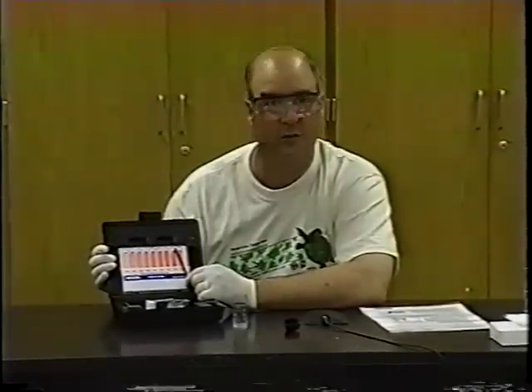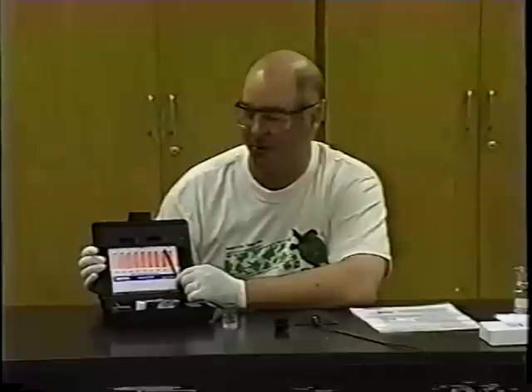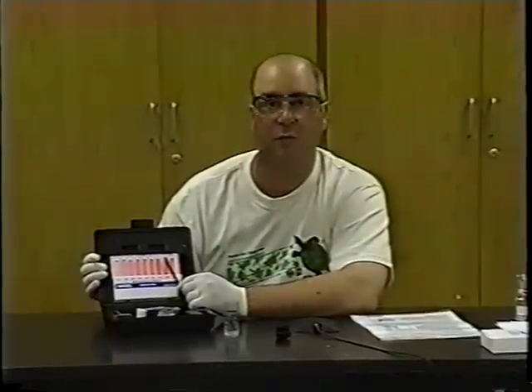That's all there is to do the test. Hopefully when we go down to the river, we won't see that much nitrate. I knew my fish tank probably had a lot because the filter mechanism wasn't working, so there was a lot of excess nitrogen in the water. There's our test for nitrate done once for you. Now you can practice it in the classroom before you go out to the river, and then perform it accurately when you get there.